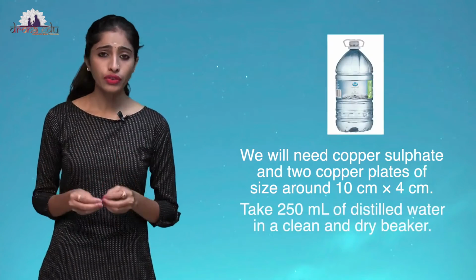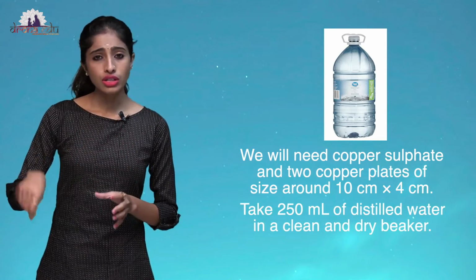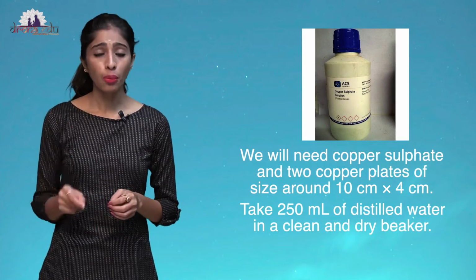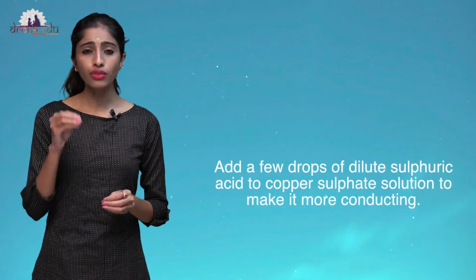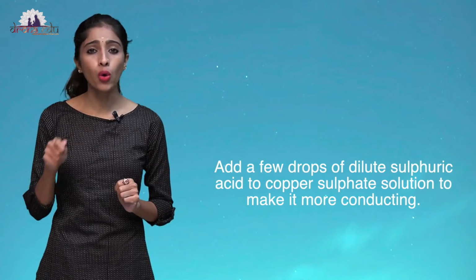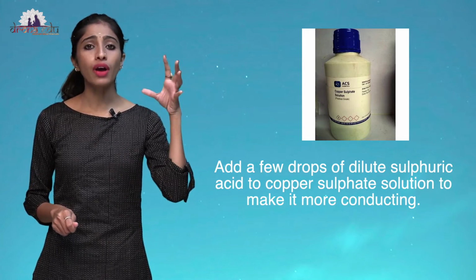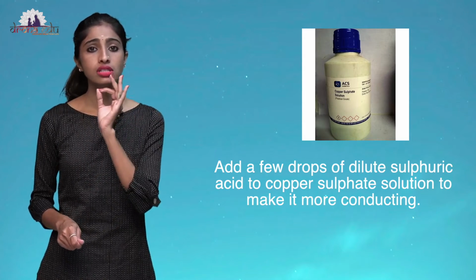Now take 250 ml of distilled water into a clean beaker. Now dissolve 2 teaspoonfuls of copper sulphate into it, making a copper sulphate solution. Add a few drops of dilute sulfuric acid to this copper sulphate solution so that it will be more conducting. The solution becomes a better conductor when you add some amount of acid in it.